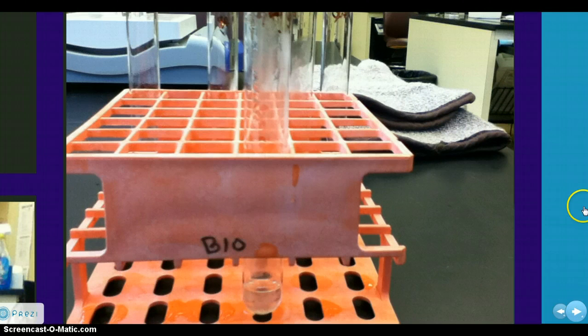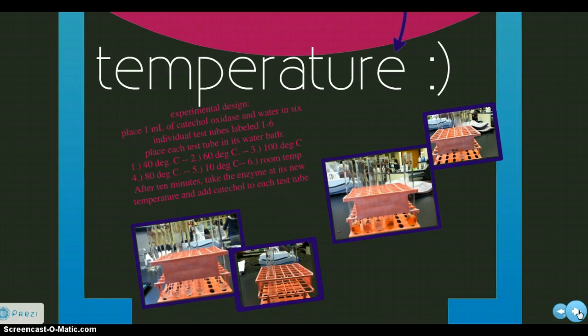And that's test tube 5, which is our ice water bath. What we found was that it didn't have much change. This was because when a protein is cooled or nearly frozen, like we did, its production slows down and sometimes even stops working. So that's our temperature portion of the experiment.